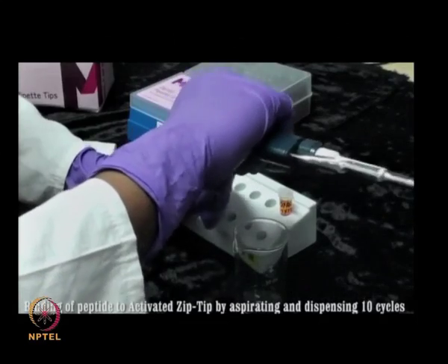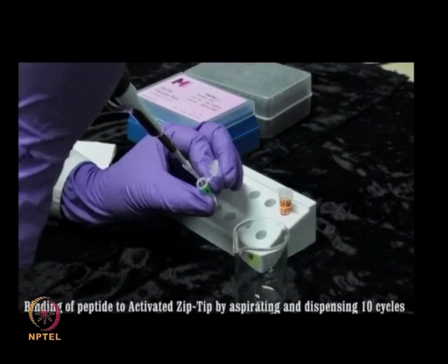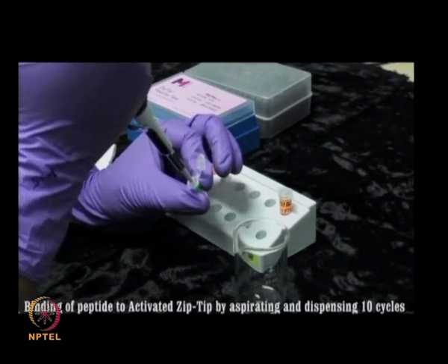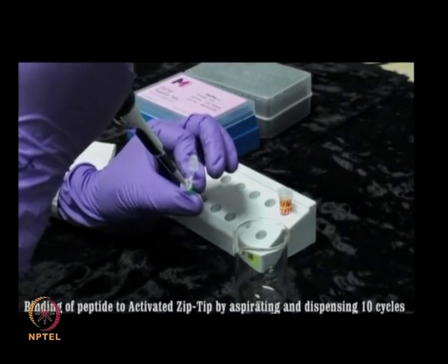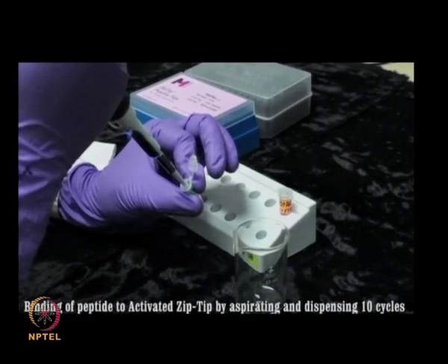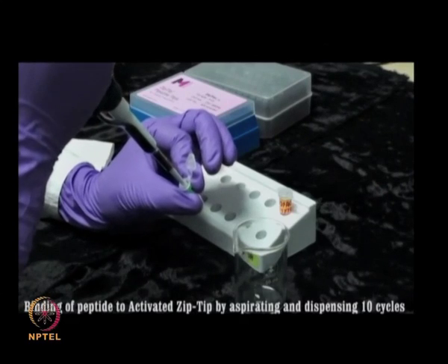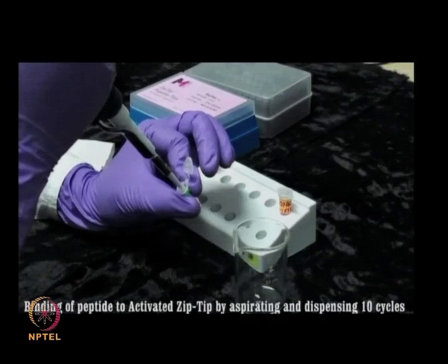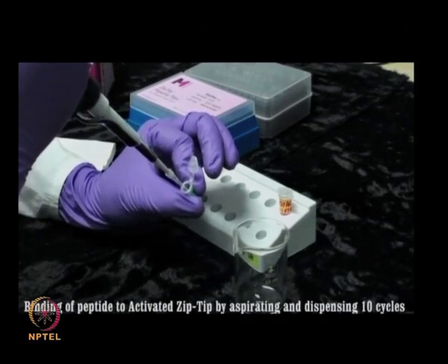Now, load the sample of your interest onto the ZipTip by pipetting 5 to 10 microliters of sample, and this step has to be repeated 10 to 15 times. You can do the binding of peptides to this activated ZipTip by aspirating and dispensing for 10 cycles.